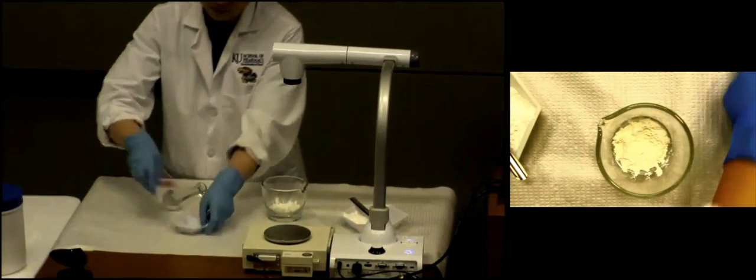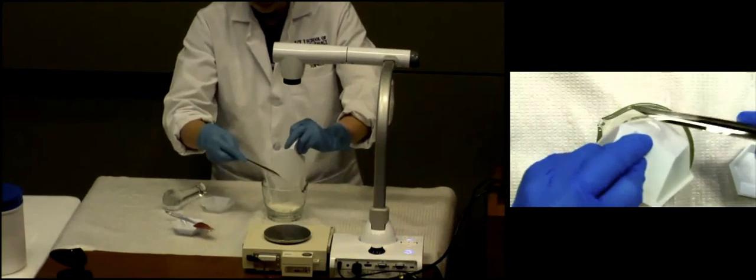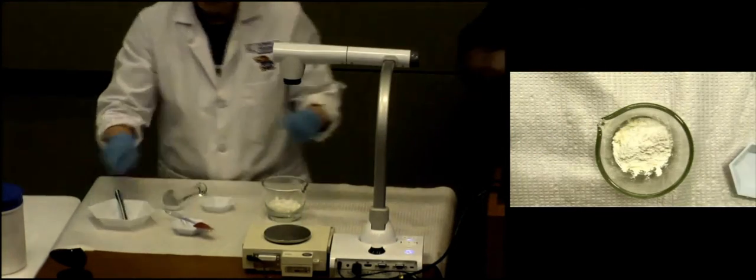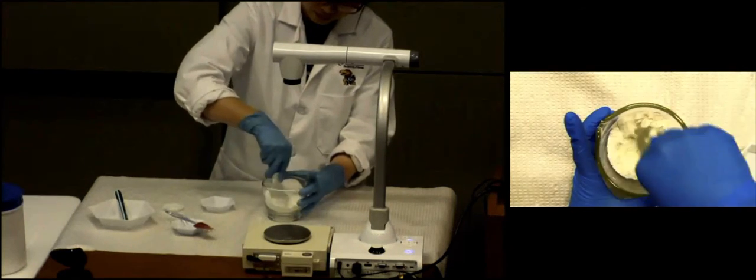It says to transfer blank amount. You see where it says 22 grams? Circle that. You have to be specific. You have to tell me exactly. You cannot just say transfer product. I need to know transfer how much. In this case, 22 grams of product.